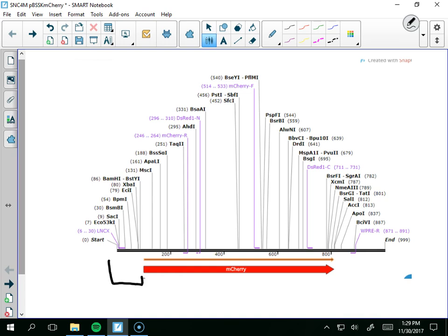Which enzyme did we pick for that? Most of you actually picked the correct one. It was awesome. I was so happy that you got this. Shout it out. BamHI! Oh, you went to XbaI? XbaI is at 80. BamHI's at 86. XbaI is not wrong. It could work. You're only 6 base pairs off. But if we're really going super tight, go to BamHI. But that's fine. As long as you got it to work, then it worked, and it would work if you actually did it in the lab. So we'll call that restriction endonuclease number 1.